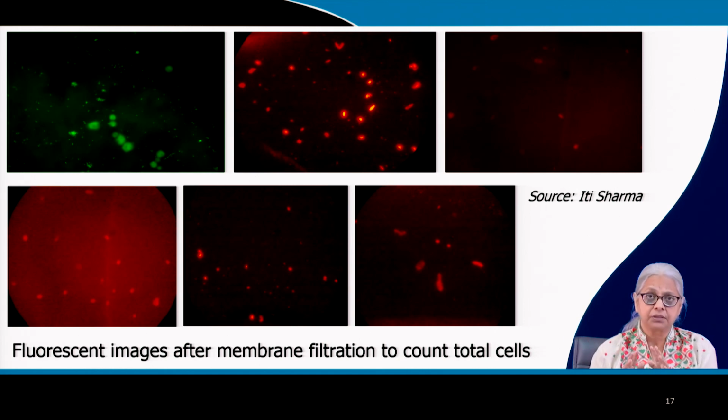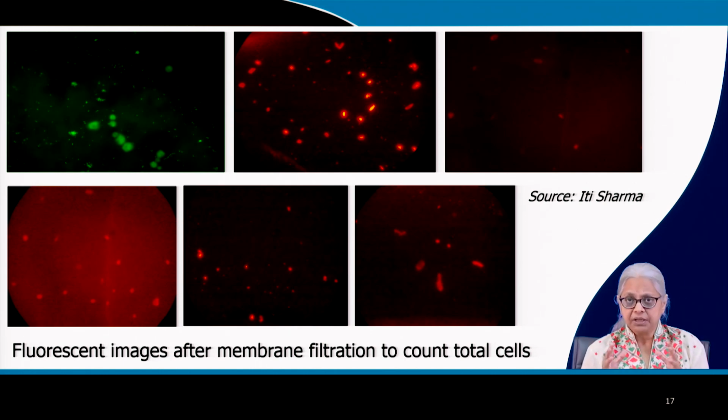This is just acridine orange, no other dye. And the orange and yellow colors are associated with the dye at the time that it is created. So the very first 5 minutes is when you can do some useful work with this dye, and that's why having a camera and a PC is very important, because then you can capture the images in the very first 5 minutes and then count the number of bacteria when you get time.